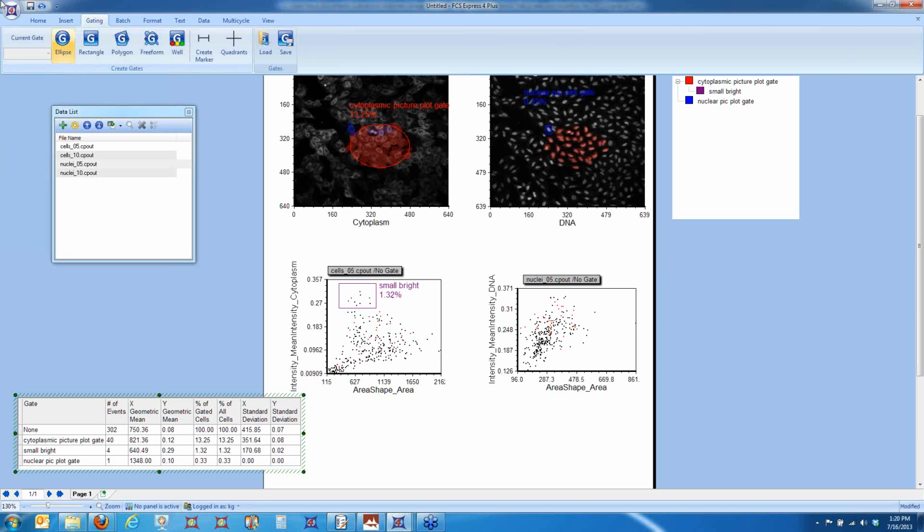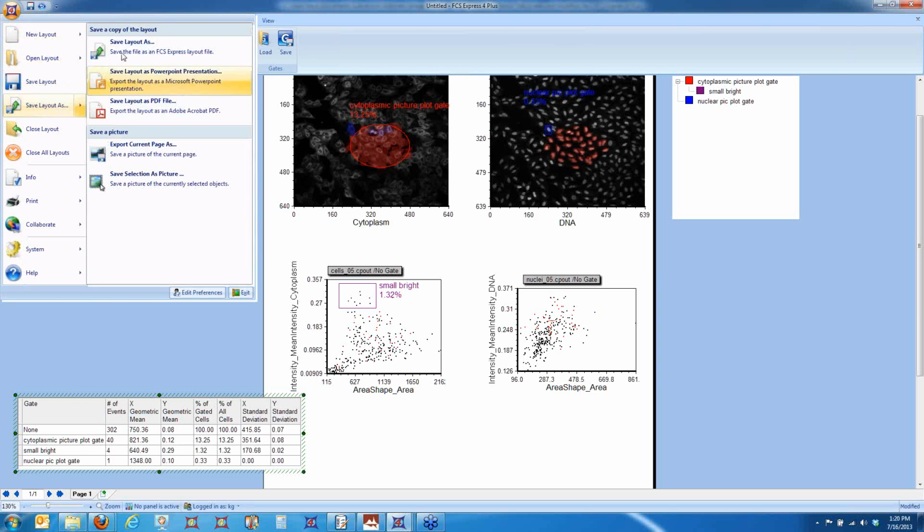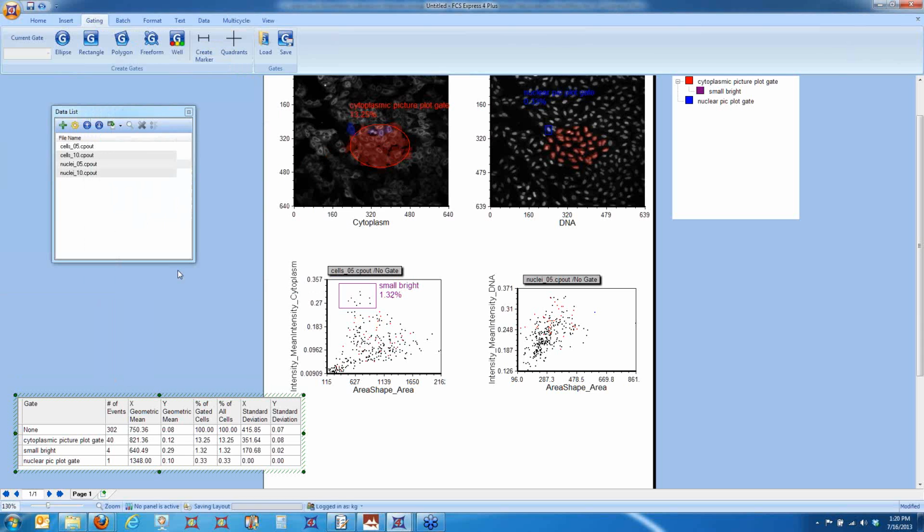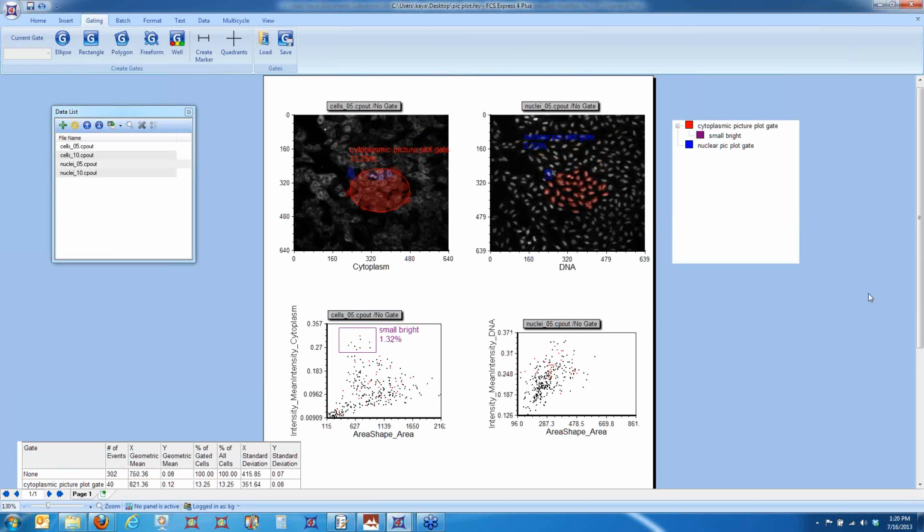All right, so let's save this layout real quick. And let's save this to our desktop. And now I just want to show you how easy it is to transfer your analysis to PowerPoint or PDF or what have you.